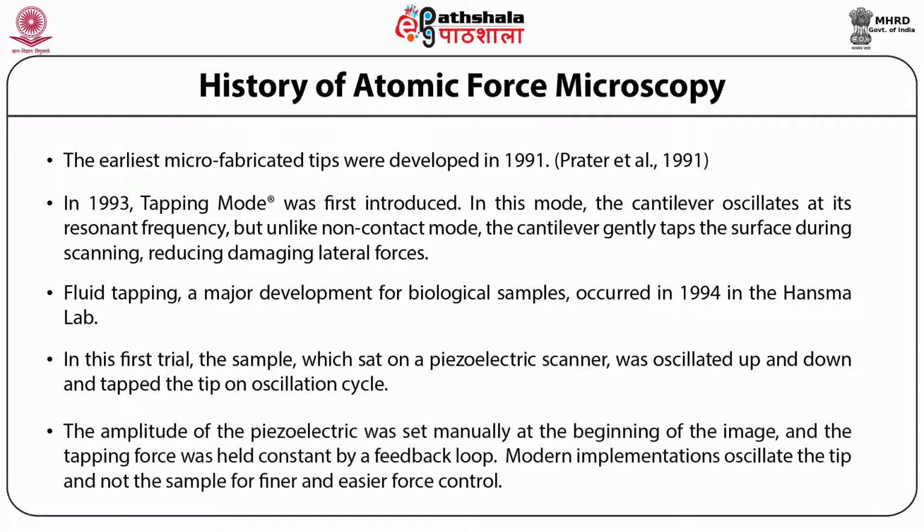The amplitude of the piezoelectric was set manually at the beginning of the image, and the tapping force was held constant by a feedback loop. Modern implementations oscillate the tip and not the sample for finer and easier force control.